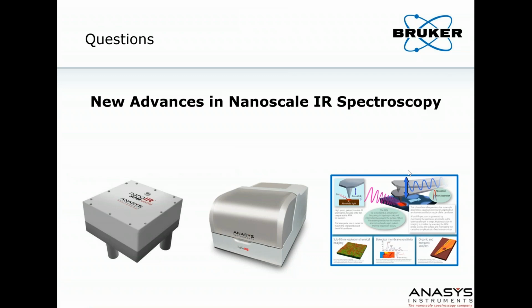So then there's a question. It says, for your older model Nano IR2, the resolution of the chemical imaging is limited by the AFM tip. I think basically it's asking, is the resolution of AFM-IR limited by the tip radius and the laser spot size? Yes. It's not dependent on the laser spot size, because you can't really focus it smaller than about 20 microns. And so the key is the tip. Ideally, that would be the limiting spatial resolution, the diameter of the tip.